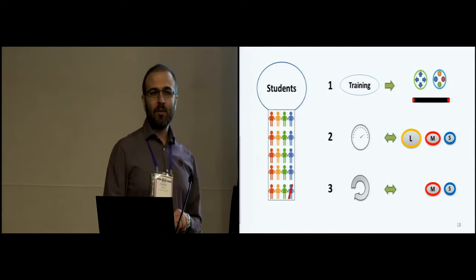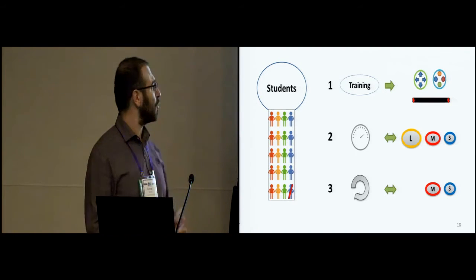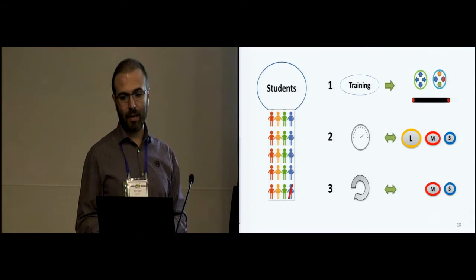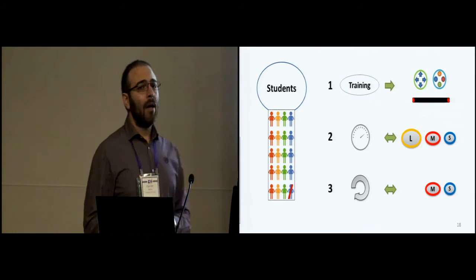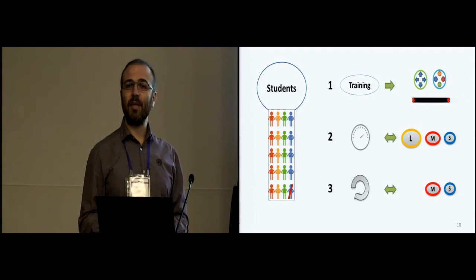In our experiment, 20 graduate and undergraduate students participated. We had to discard the results of one participant, because it was obviously an outlier. The details are in the paper. And the experiment, which I'm presenting here, is composed of 3 main stages.